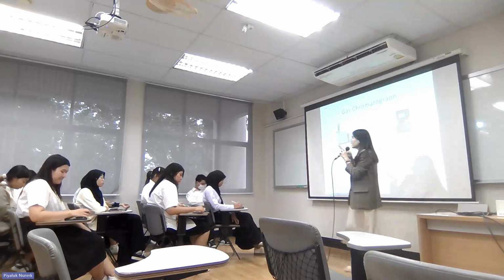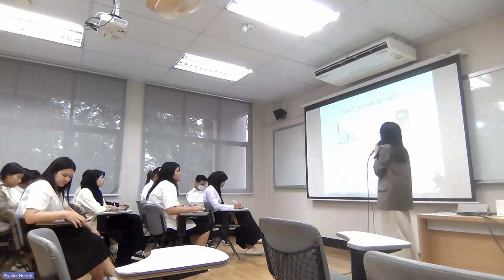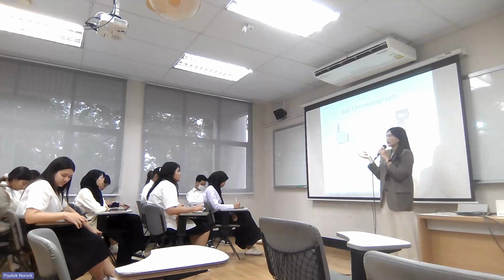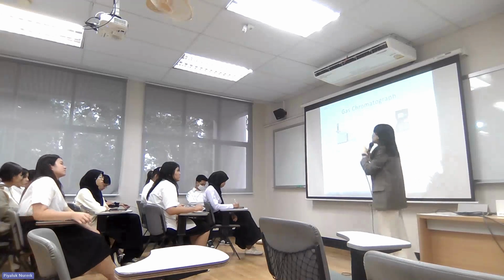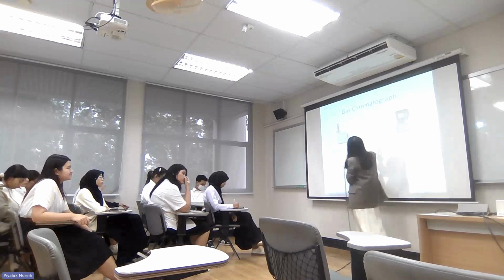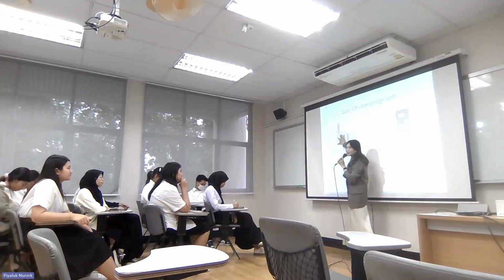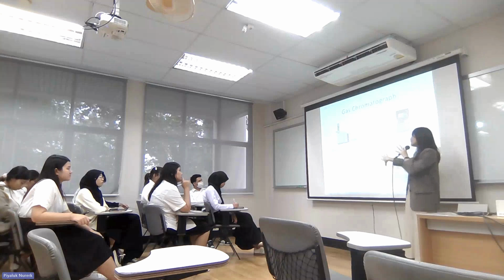In this slide, I show you the general gas chromatograph. The instrument for gas chromatography, sometimes we call the gas chromatograph. This is the name of the instrument of the GC. The design of the GC is similar to an oven, like a square rectangular oven.